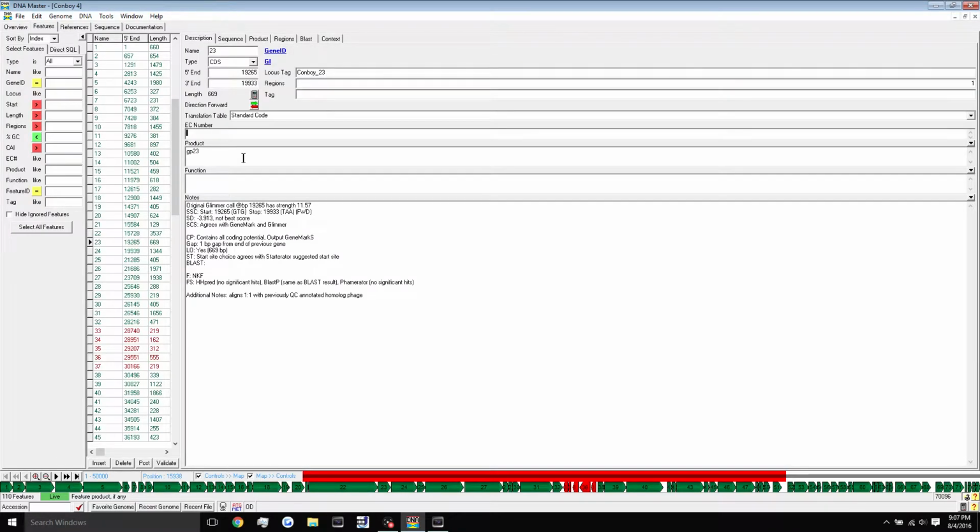It's very important that you not only know how to input your data into the BLAST tools, but also that you know how to interpret the results. I'm going to teach you guys that today. This isn't in any particular order, you can do these in any order you wish, but I always do it in this order because I personally think it's easiest. The first thing we're going to do is go up here to the BLAST tab.